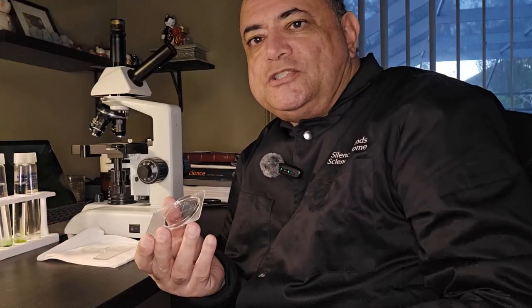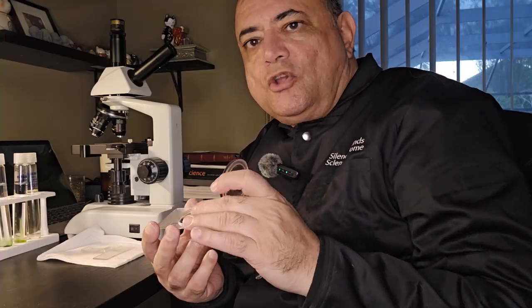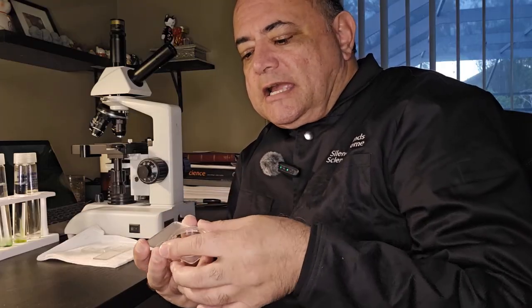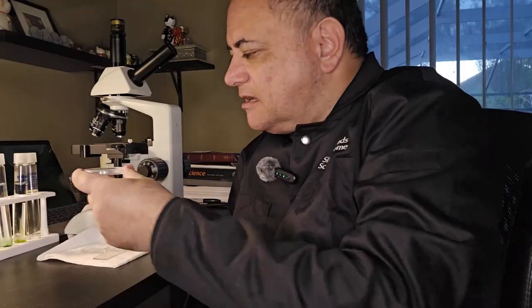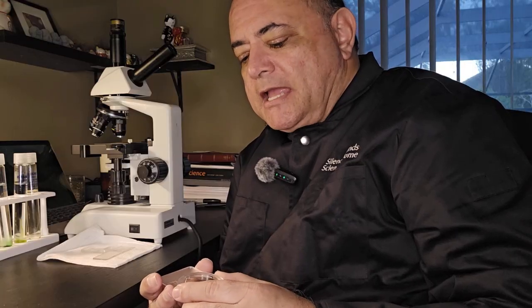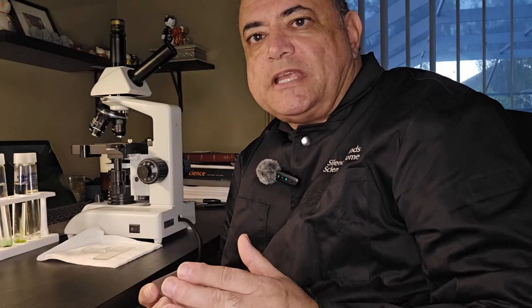What you do is you pipette your culture into the little Petri dish, and then this just sits on the microscope stage, and you can view microorganisms freely as they float around and carry on with their everyday life. And it prevents any squashing that could potentially happen when you just use a microscope slide and cover glass.